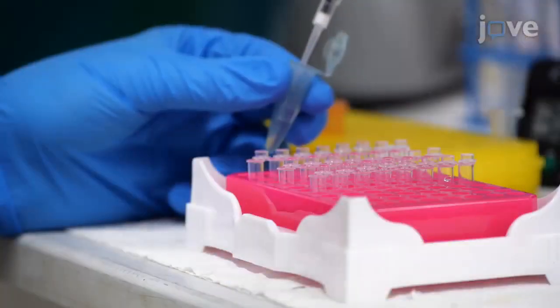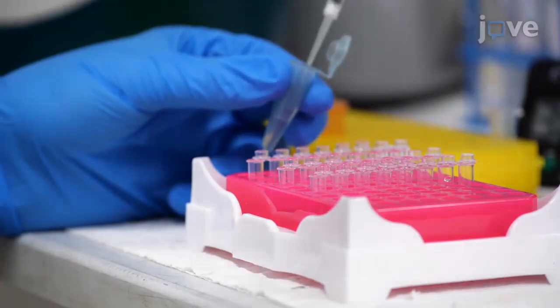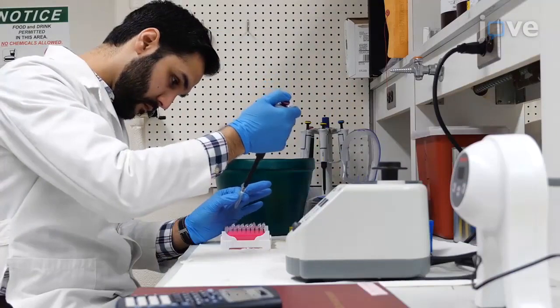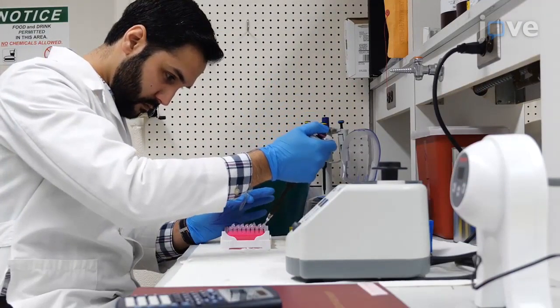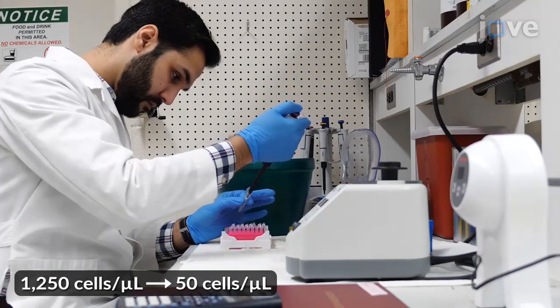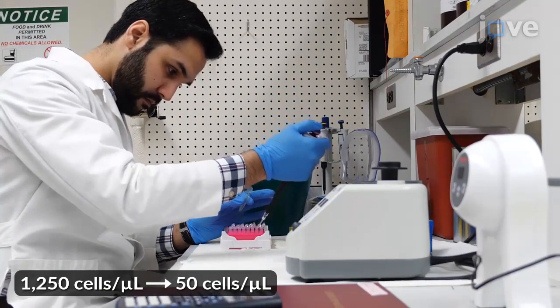After the cell lysis, pipette 48 microliters of extension master mix into each PCR tube. Add 2 microliters of diluted lysate to each PCR tube to reach a final cell equivalence of 50 cells per microliter and continue the telomerase extension reaction according to the manuscript.